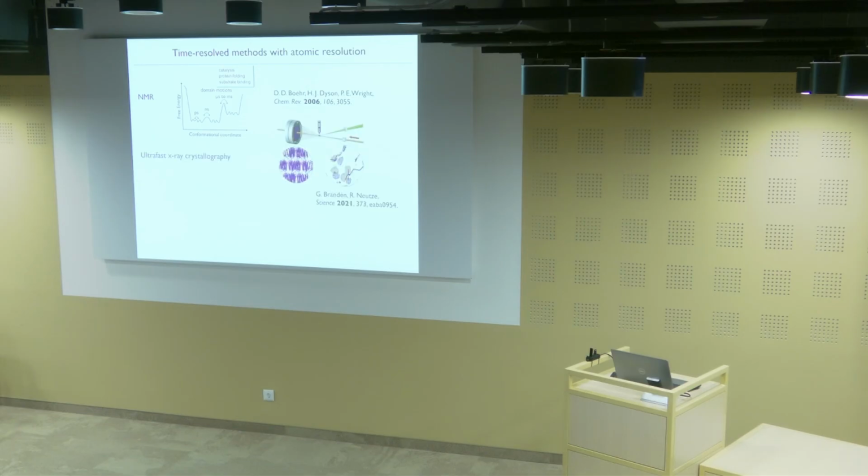And then to many of you, ultrafast X-ray crystallography is very familiar, and there are beautiful experiments that have been done here. The only catch is that, of course, your experiment always has to happen within a crystal, and protein dynamics don't naturally occur within a crystal. It's well known that these large-amplitude motions tend to be hindered by the crystal packing. The process we want to look at, it's very hard to see how that would fit into a crystal. And then finally, there's cryo-EM, which also exists in a time-resolved version. There you get a time resolution of about milliseconds.